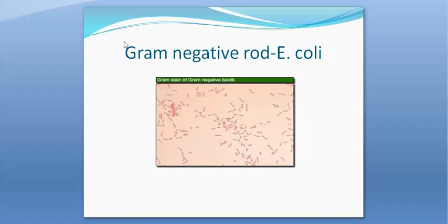This slide shows gram-negative rods. They're a little bit difficult to see, but they are E. coli, which is a gram-negative rod.